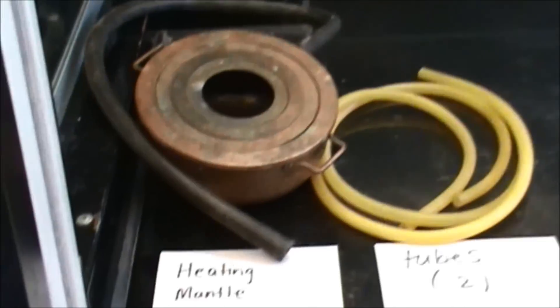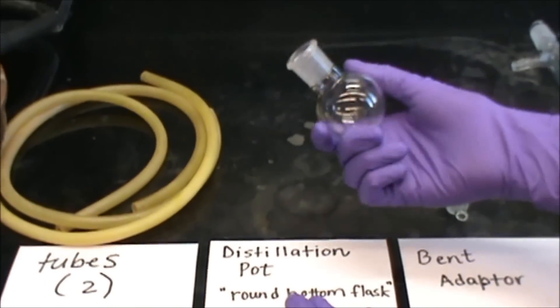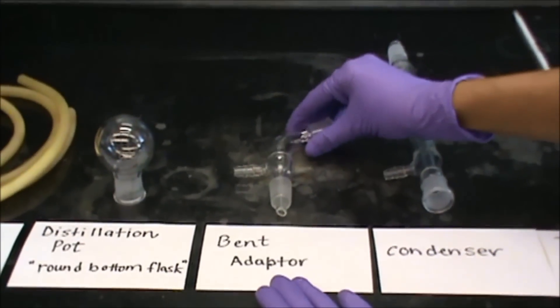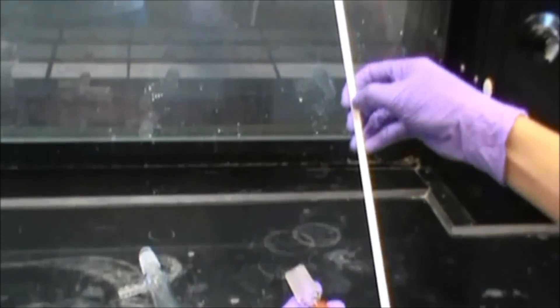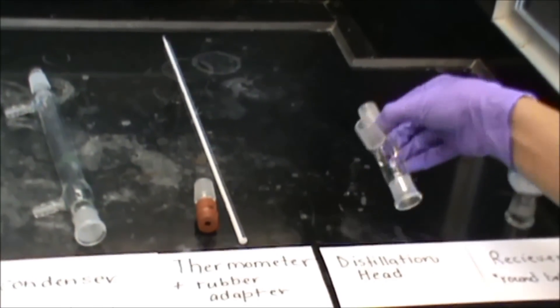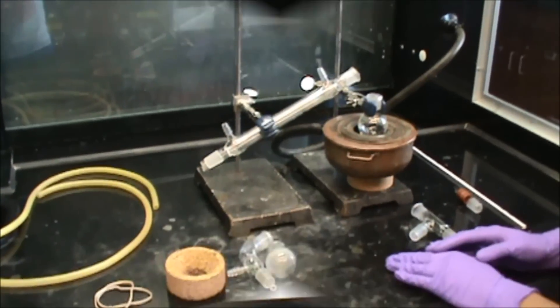Hi everyone, welcome to organic chemistry lab. Today I will be showing you how to set up a simple distillation and fractional distillation. The equipment that we will be using for the setup is a heating mantle, two tubes, a distillation pot, a bent adapter, a condenser, a thermometer with a rubber adapter, a distillation head, and a receiver, which is just any round bottom flask.